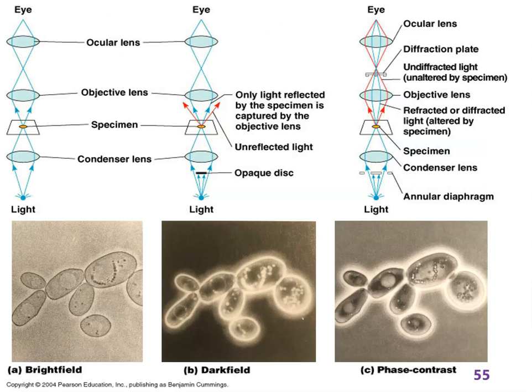Okay, those are techniques for seeing the size and shape of microorganisms. That's about all you can do with any of these. You can't learn much from the size and shape, so you just say, okay, they're round, they're a certain size, and that's about all you can get from any of these. Dark field and phase contrast, you can look at living cells. So if they're swimming around, you can see them swimming. Whereas bright field, typically you would look at stained samples.